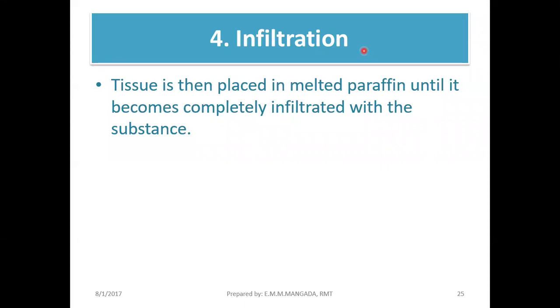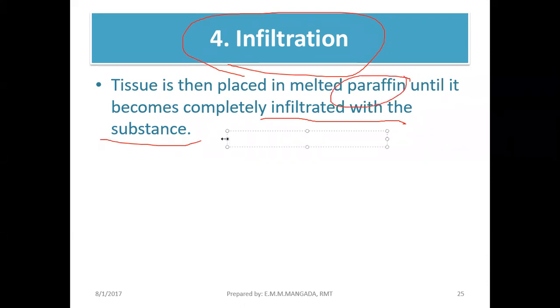Guys, your infiltration is also known as your impregnation. Why? Because in the infiltration process, what we're going to do is to infiltrate the tissue with a substance or with paraffin. The most commonly used medium for impregnation is your paraffin wax.